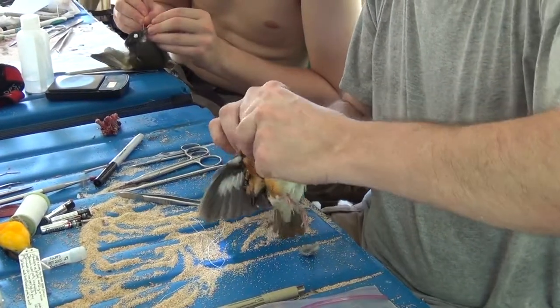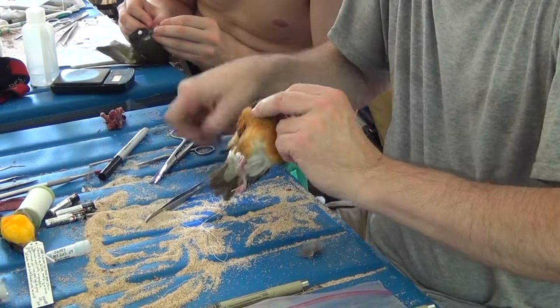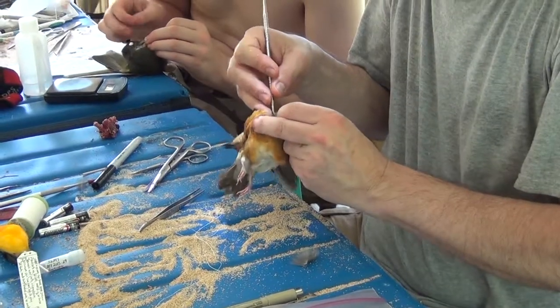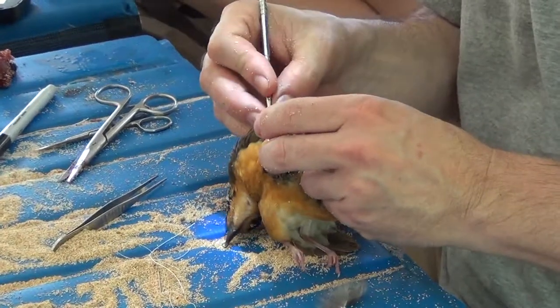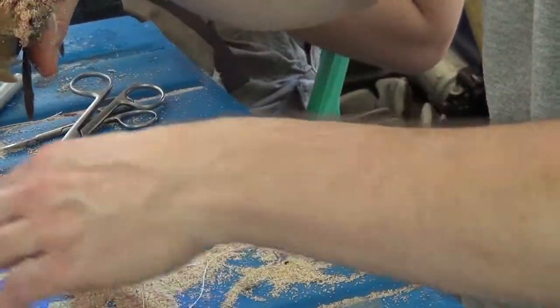I'm about to cut the second wing, which will make my life quite a bit easier. There it goes. And now we basically just are going to pull the skin down the back of the bird. Notice I'm keeping lots and lots of sawdust on the bird.